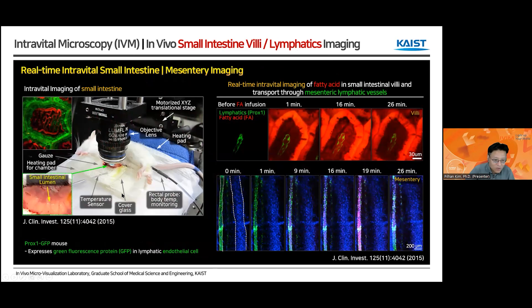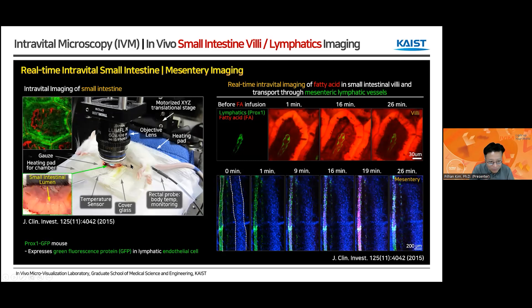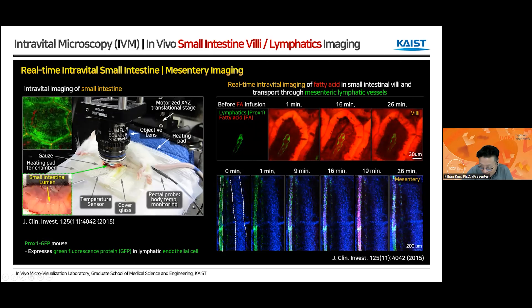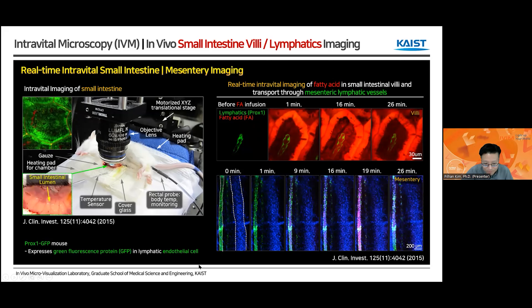This is the example of the small intestinal imaging — work published in JCI in 2015. We exteriorized the small intestine, exposed the lumen, and dropped fluorescent lipid in red color. We can see how those fluorescent lipids are absorbed through a single villus and transported through the lymphatic vessel inside the mesentery. From zero to 26 minutes, you can see this red lipid transported through the mesenteric lymphatic vessel. In this example, we use a Prox1-GFP mouse model.